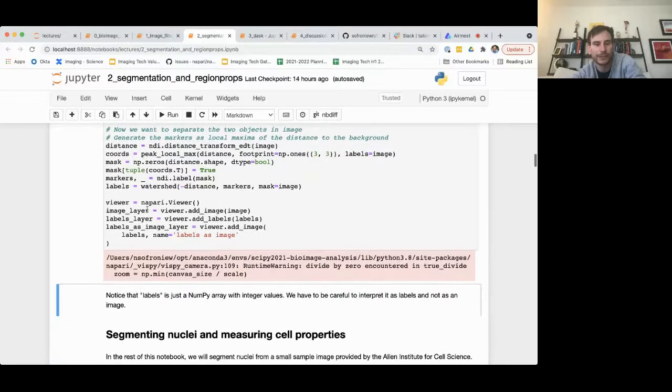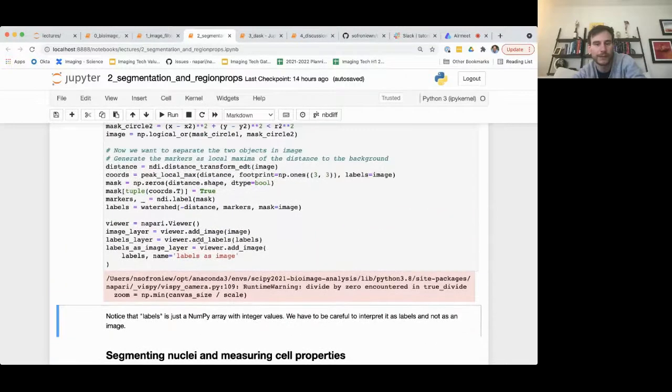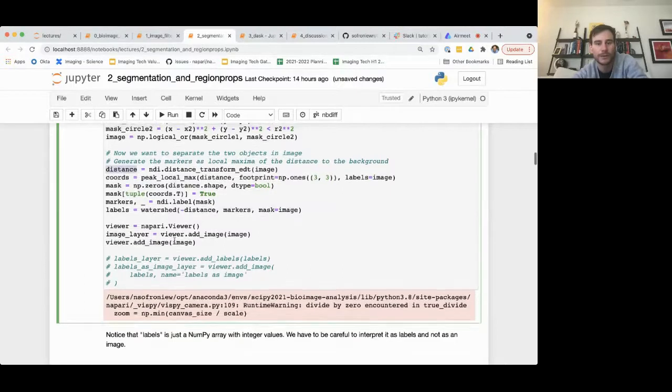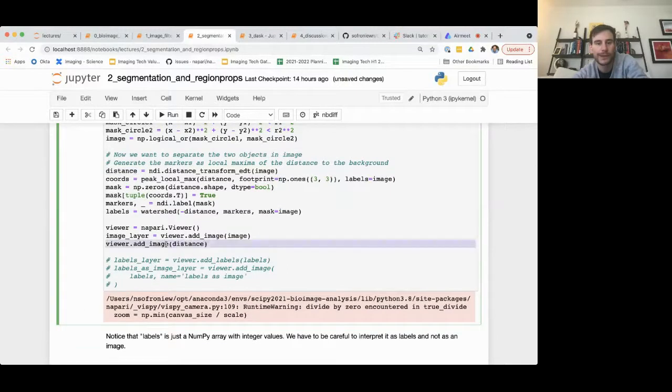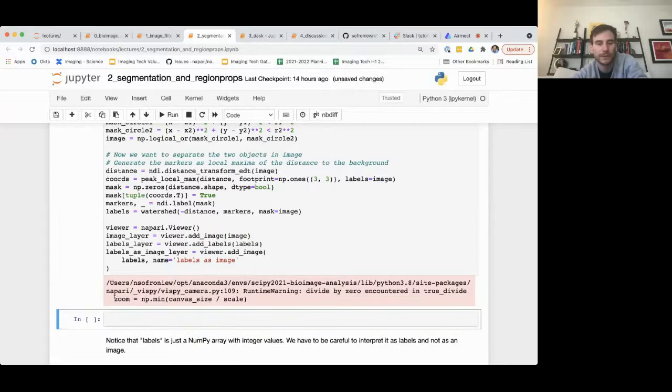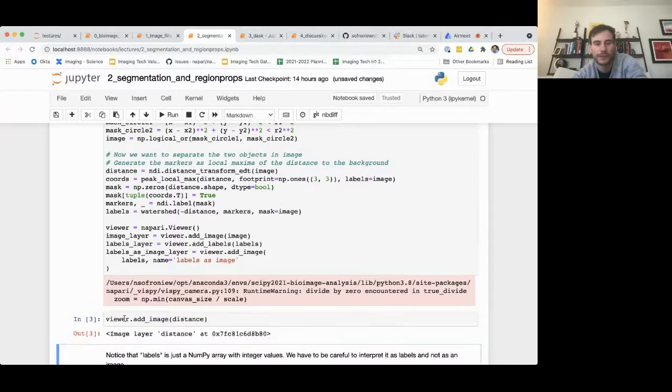I'm actually going to do a little live adjustment here, because I think it's going to be even easier if I plot the distance transform for folks to look at at the same time. So I'm just going to pop in here, and I'm going to add that in another cell. So going off script a tiny bit, but I think it's actually going to be useful.